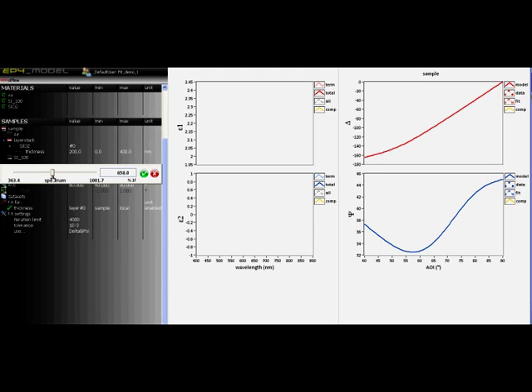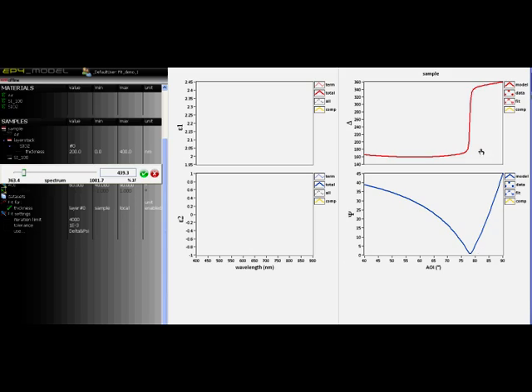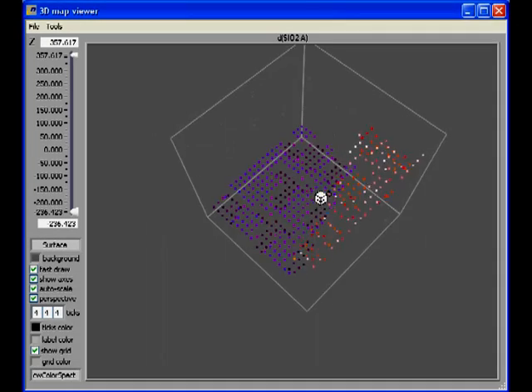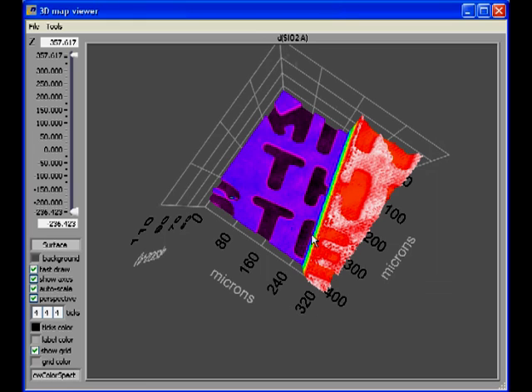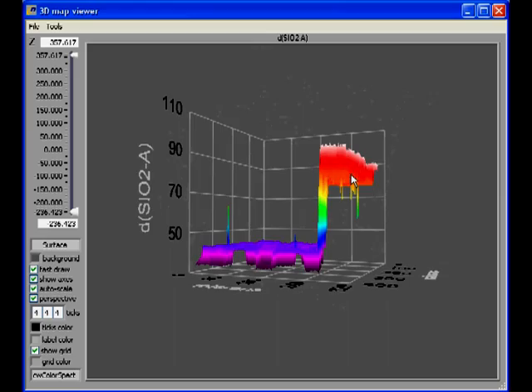The integrated simulation program allows you to select the optimal measuring conditions for your application. Besides the measurement of defined regions, the software may be used to generate, for example, layer thickness maps of the entire field of view.